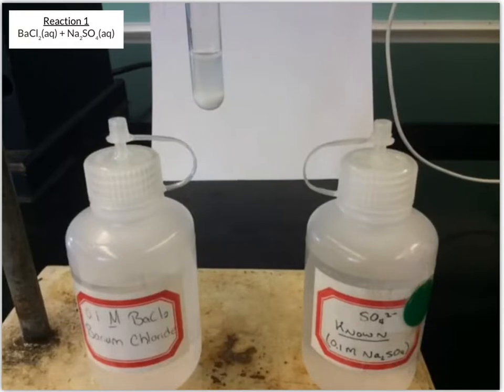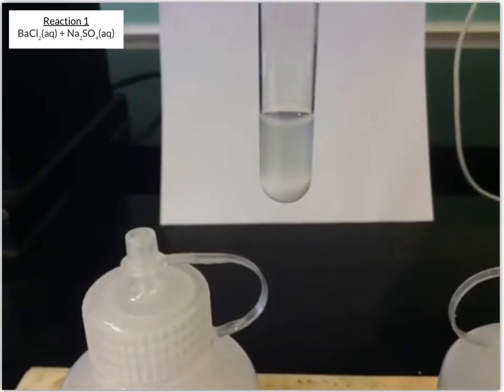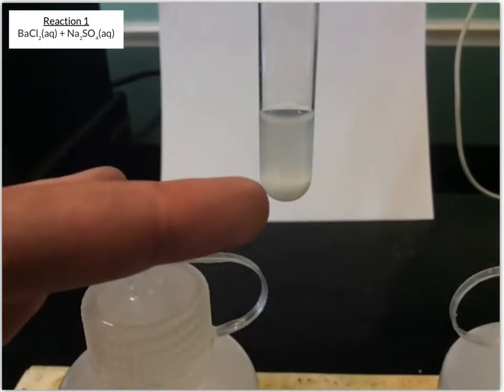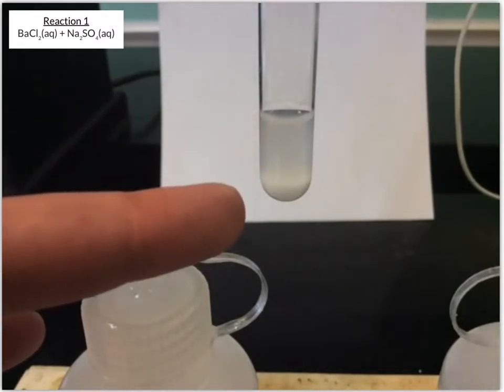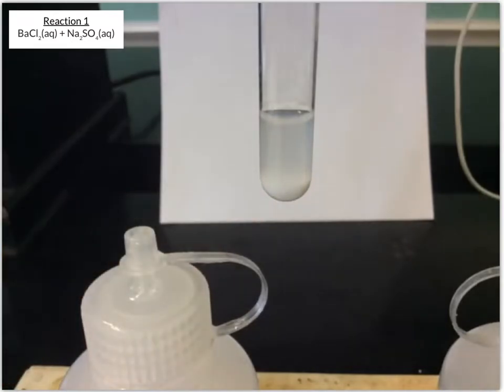Now that we've given it lots of time to settle, you can see that the solution is starting to clear up, and we've clearly got some white solid down at the bottom of the test tube, whereas up here it's starting to clear up. There's still a little bit of solid floating around. It's taken a while to settle, but we definitely had a precipitation reaction occur.